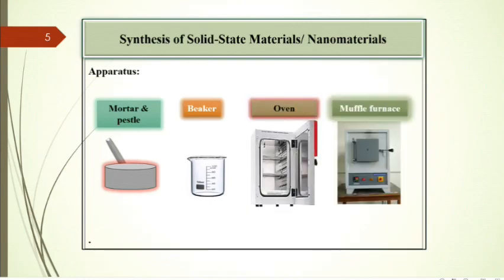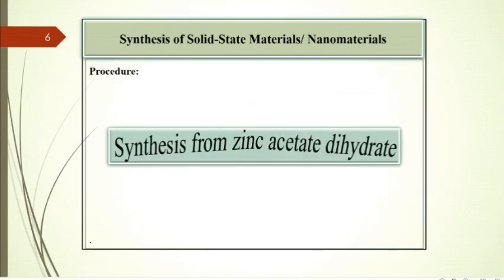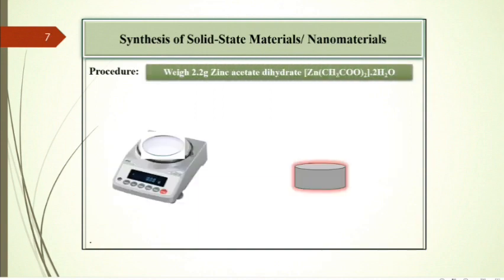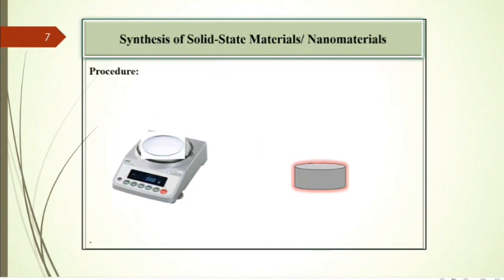Procedure: Synthesis from zinc acetate dihydrate. Weigh 2.2 gram zinc acetate dihydrate and then transfer it in a mortar. Then weigh 1.7 gram oxalic acid, also transfer it in the same mortar and grind with pestle for 15 to 30 minutes. It may form paste.